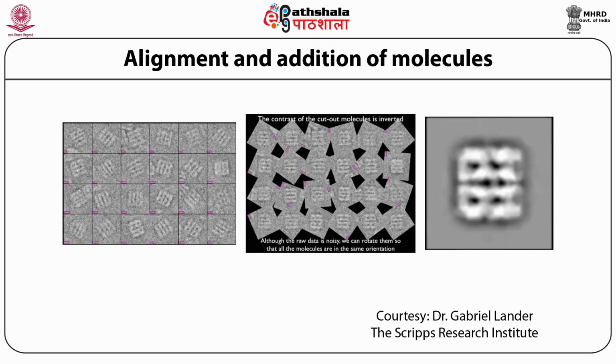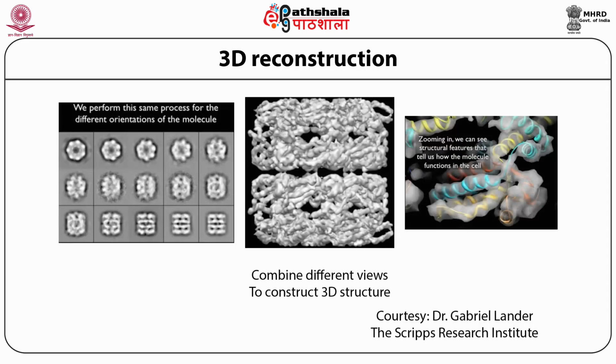So what this is actually doing is that your signal is amplifying and your noise is suppressing. Noise is random, which has to go down, and the signal should be amplified as the number of images is more. So to get a better resolution, you need a greater number of images to be superimposed. Similarly, you have to get image reconstruction of two-dimensional images of different orientations of molecules.